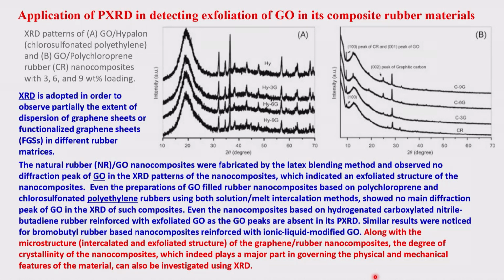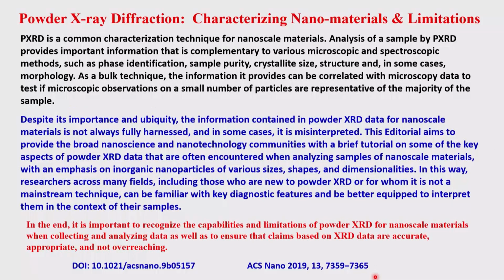Okay, so we have looked at quite a few examples of this. I just came across one publication very recently in the ACS Nano 2019. This paper is basically published with the following information. No doubt that X-ray diffraction can be used very well for characterizing the material, nanomaterials.